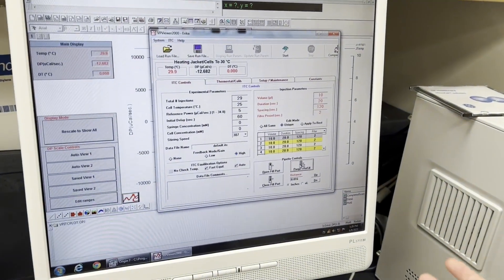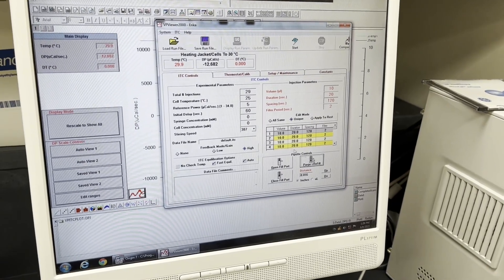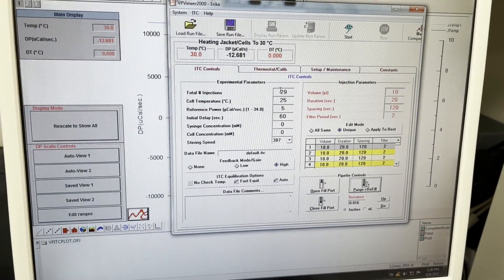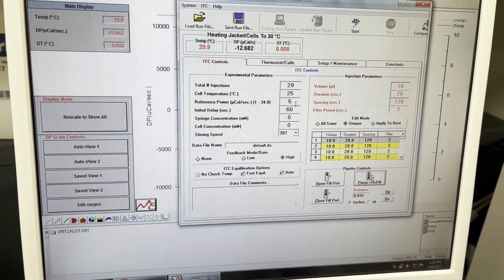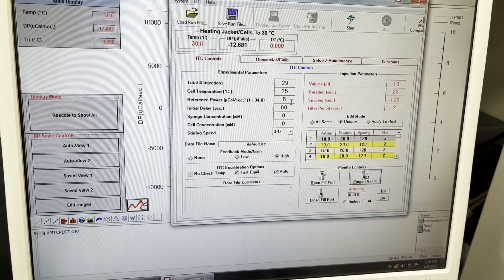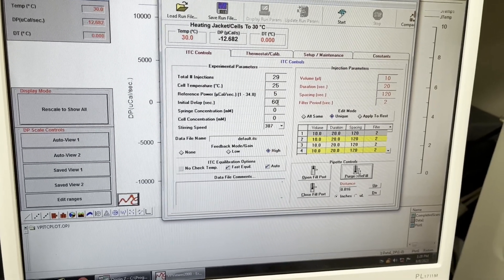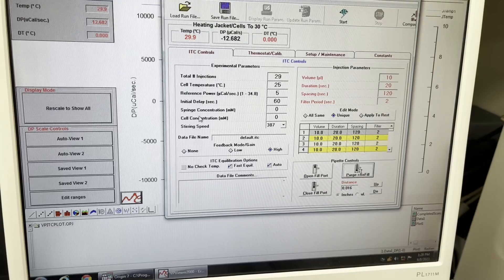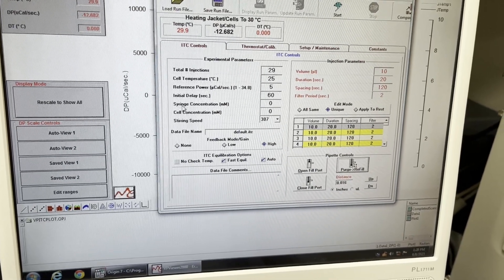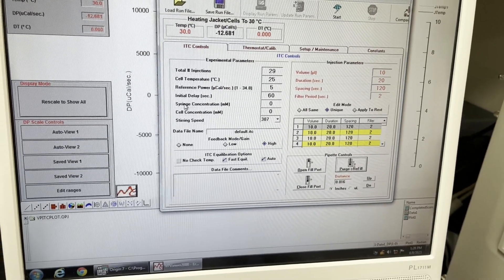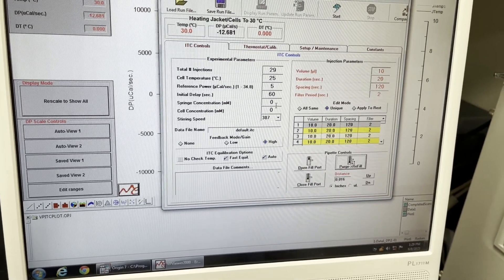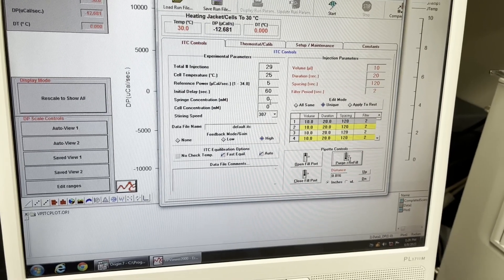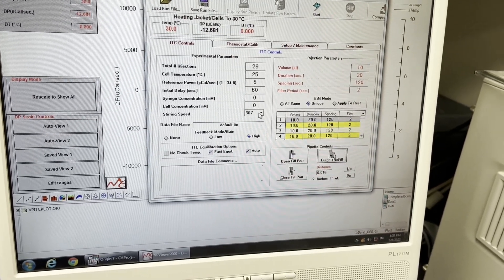Then you want to come to the computer and here it's really dependent on your experiment. You can change the total number of injections, the temperature. I usually don't mess with the reference power, it's calibrated pretty nicely, or the initial delay before injection. What is very important for ITC is knowing the exact concentration of your sample in the syringe and your exact concentration of your sample in the cell. So you can input these. You can adjust the stirring speed if you would like.